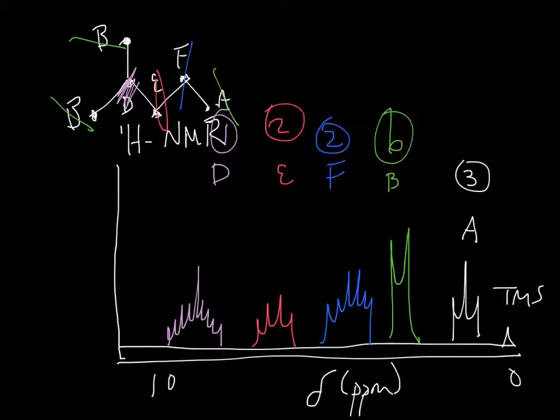Now, what about alcohols and carboxylic acids, for that matter? They both have hydrogens. The rule of thumb is, if you have a good magnet, their hydrogens do not split. They always come up as a singlet for any decent NMR. And the reason why is because those hydrogens are constantly popping off, doing what's called solvent exchange.